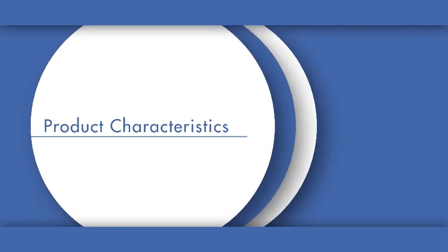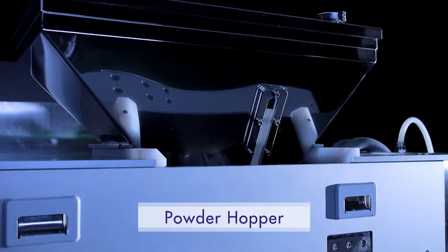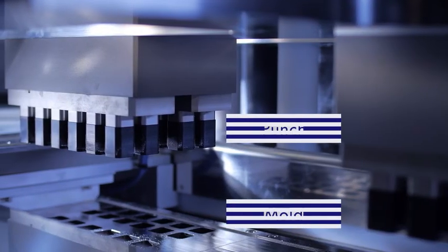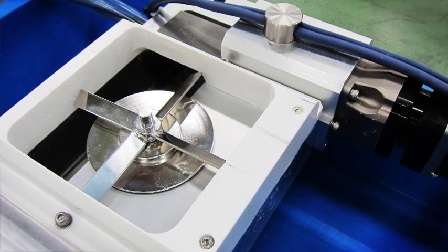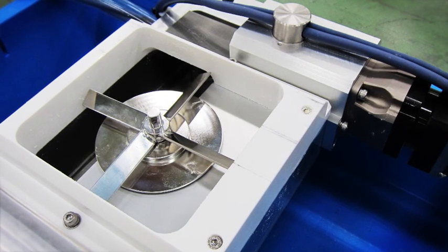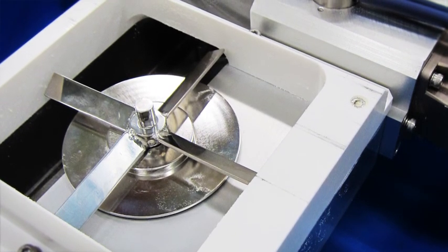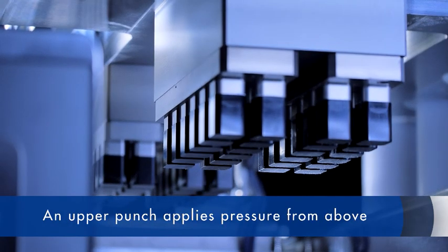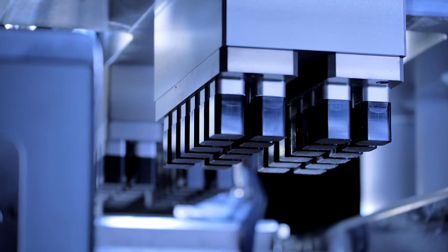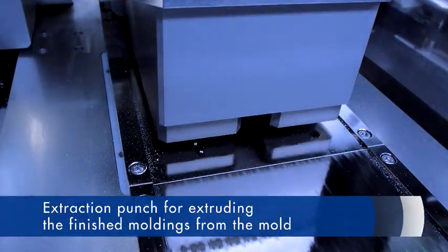Let's take a look at the powder compression molding process. Powder supplied by the powder hopper is molded by the mold and punch. Internal rotating blades enable uniform filling of powder with pore flow. There are three types of punches: a lower punch for molding the bottom of the mold, an upper punch for applying pressure from above, and an extraction punch for extruding the finished moldings from the mold.